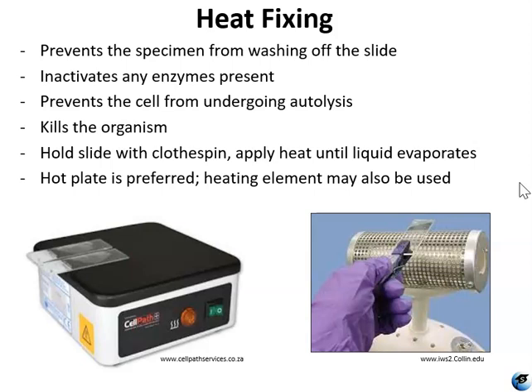So if you are trying to view, like in lab 3, specimens that are swimming around, you wouldn't want to use this technique because it will kill your swimmers. Heat fixing requires holding a slide with the clothespin, and the reason you use the clothespin is because the wood from the clothespin doesn't conduct heat as well as the glass from the slide, so that prevents you from burning your fingers. And you have to apply direct heat to the slide until the liquid on the slide evaporates.